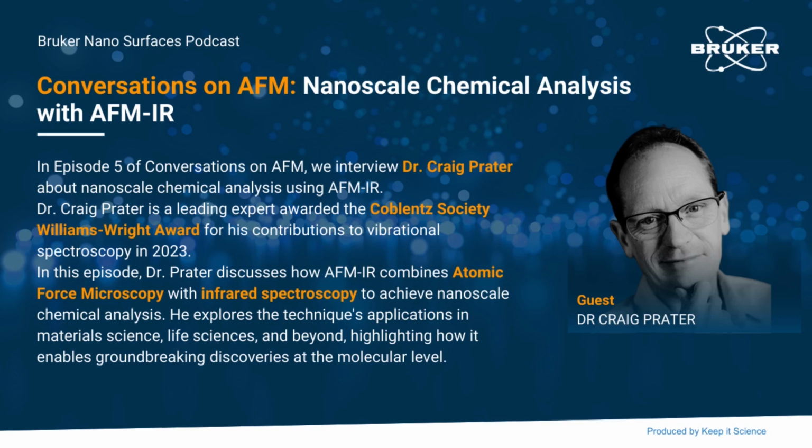Absolutely. So you use basically an infrared laser and the absorption to measure the cantilever movement. But I guess to get this IR chemical fingerprint, as you call it, you kind of need to combine two very different things. So I would be really intrigued to hear a bit more about how the idea about combining AFM with IR came about, and what was the early history of really saying, we'll bring those two together to get this chemical fingerprint?